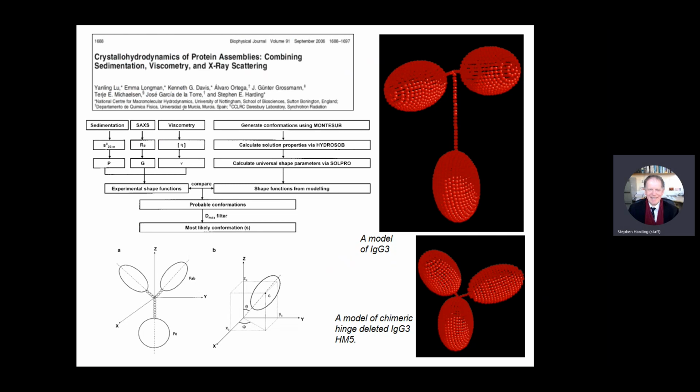Right, this is what you can do with this thing. By combining these different conformation parameters together and using a type of modeling called, remember the bead modeling I mentioned before? Bead shell models. Okay, this is published in Biophysical Journal some years ago.